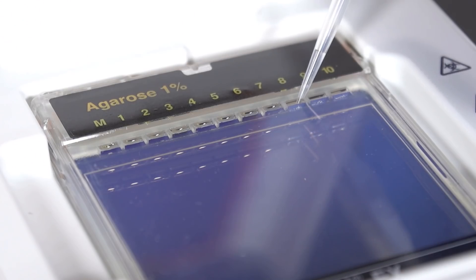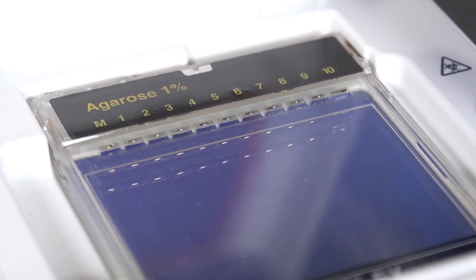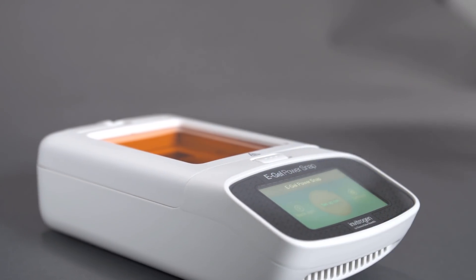Be sure to load 20 microliters of deionized water into any remaining empty wells before starting the run. Close the lid and start the run.